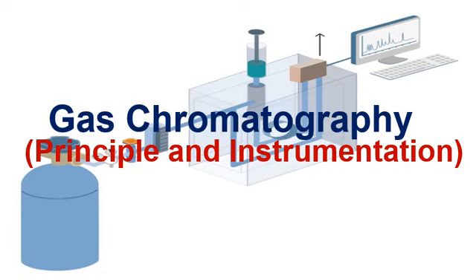Gas chromatography is a technique which is used to single out different kinds of molecules in multi-component systems. In simple words, gas chromatography is a technique used to identify different types of molecules present in multi-component compounds.